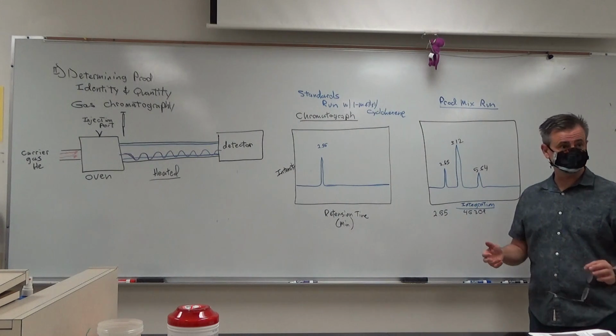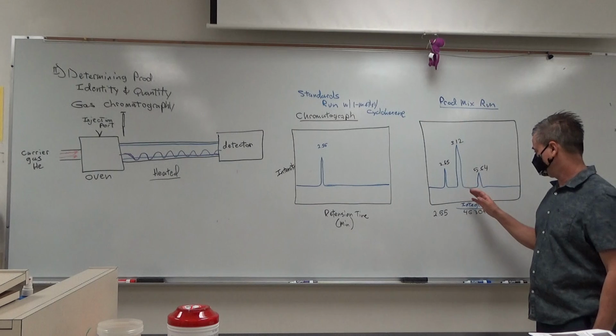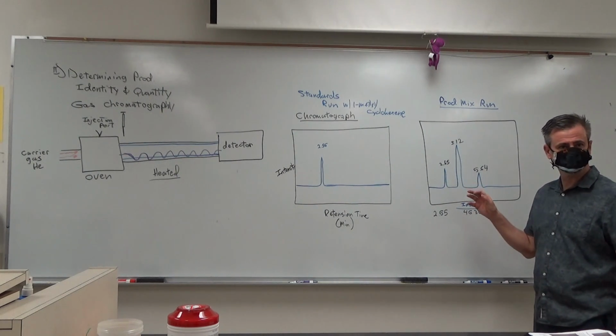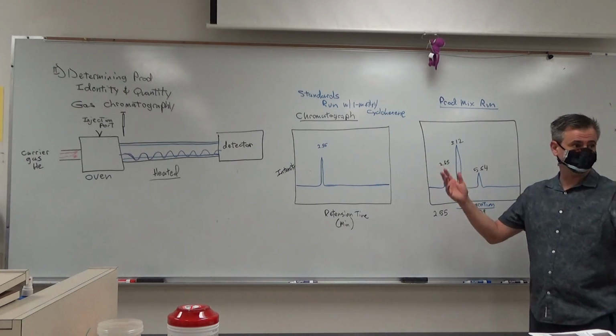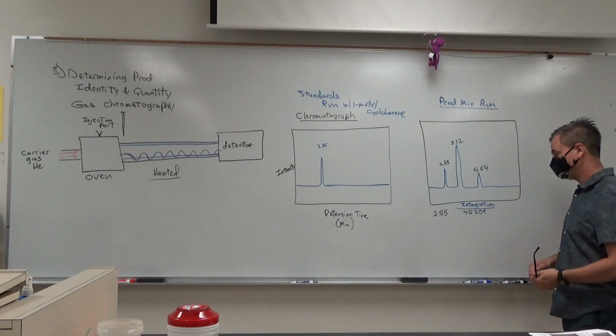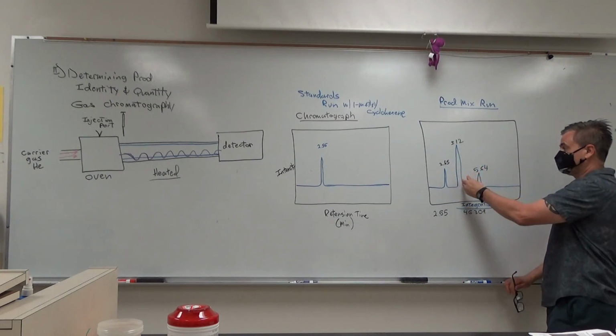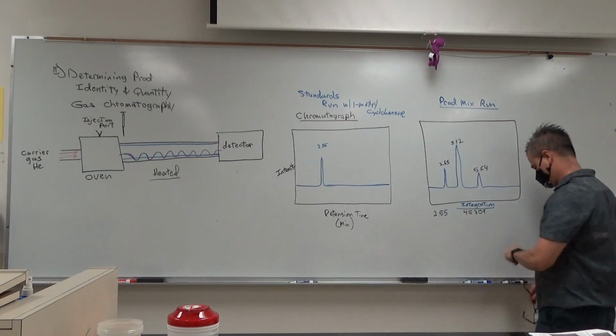Integration means exactly what it means in calculus, assuming you've had it. Has anybody not had calculus? Everybody has had calculus. So integration here means the same thing as in calculus: area under the curve. There's your curve. What's the area? That's the area.